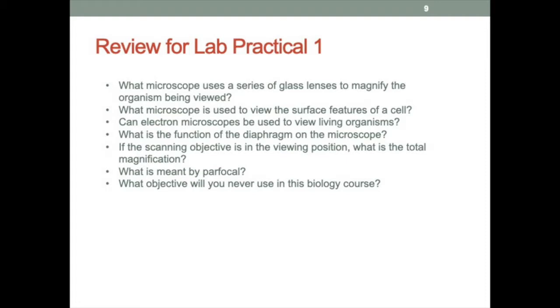All right. Review for practical 1. Just some more questions, things that I went over on here. Function of the diaphragm, just an adjustment to the light on the bottom. Anything else on here should be in your lab manual. All right, I believe that would be it.